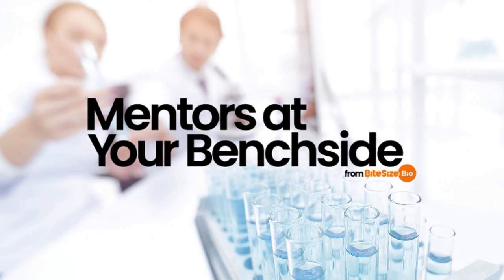So how does Maxam Gilbert sequencing work? Maxam Gilbert sequencing is also known as chemical sequencing because chemical reactions, rather than DNA and RNA amplification, are the basis of the method. It's quite easy to understand though, and it proceeds in just 4 steps. Number 1. Preparation of your sample.